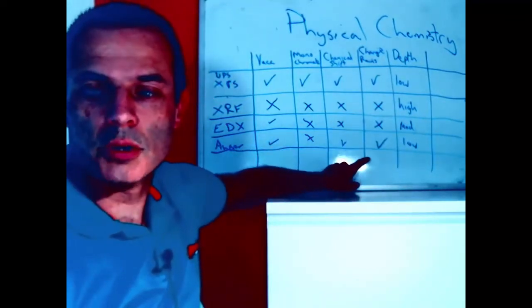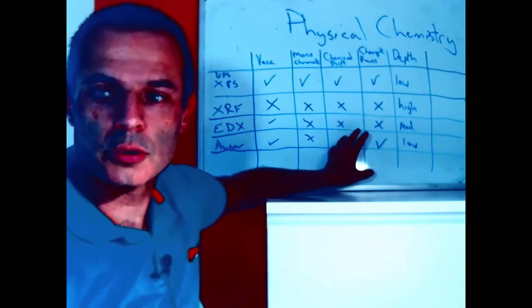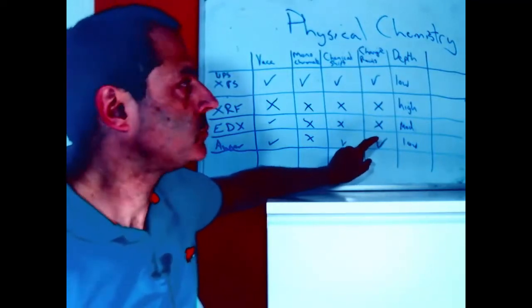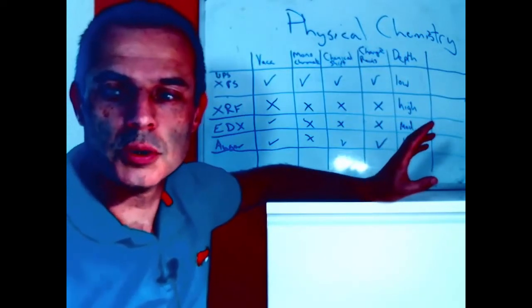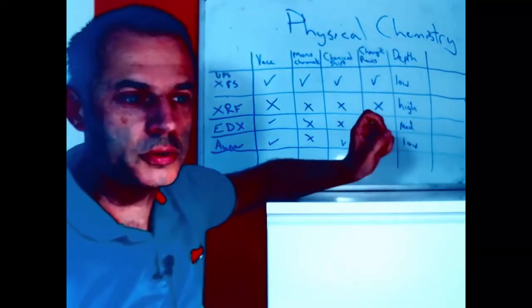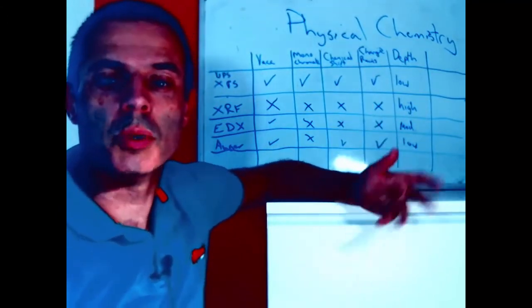Auger is obviously critically important because again we're measuring the energies of slow moving electrons, and then we must measure them accurately, otherwise we don't know what we're doing. The next one is how deep does our measurement system penetrate, and that is a combination of how deep does the thing going in penetrate and how deep does the thing coming out manage to escape from.